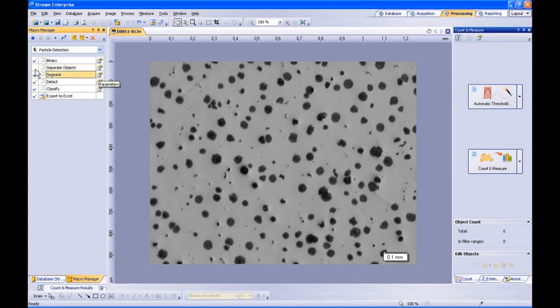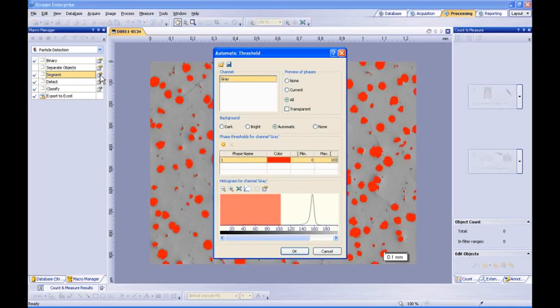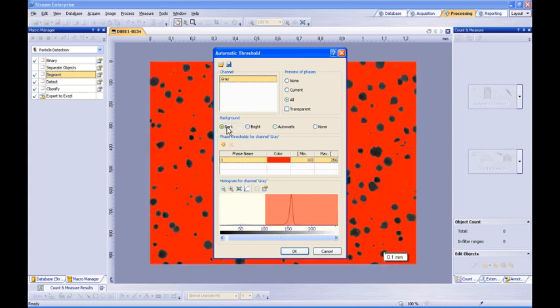Also, the parameters of any step of the macro can be modified. For example, let's say that the grayscale threshold parameters of the segmentation are too aggressive and need to be decreased. By clicking the parameters button, you can modify the grayscale thresholds accordingly. Next time the macro is run, these newly defined parameters will be utilized, replacing the former.